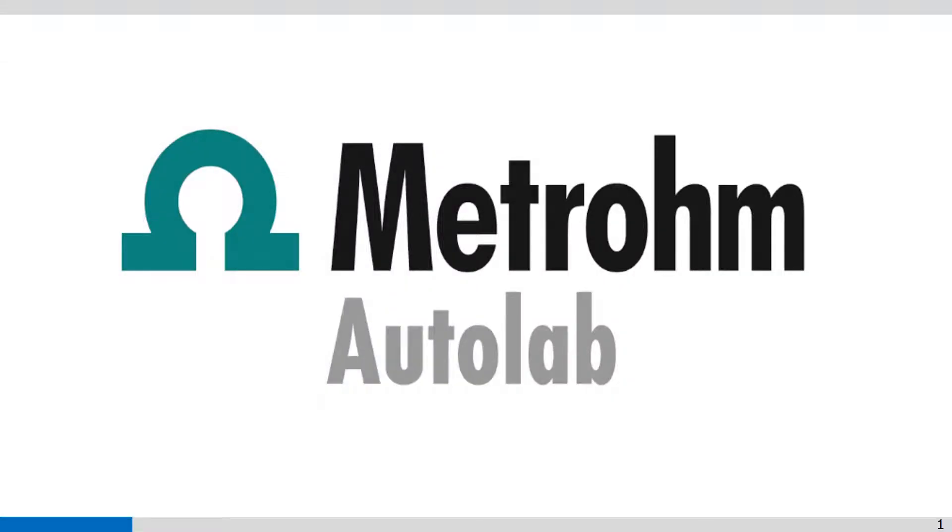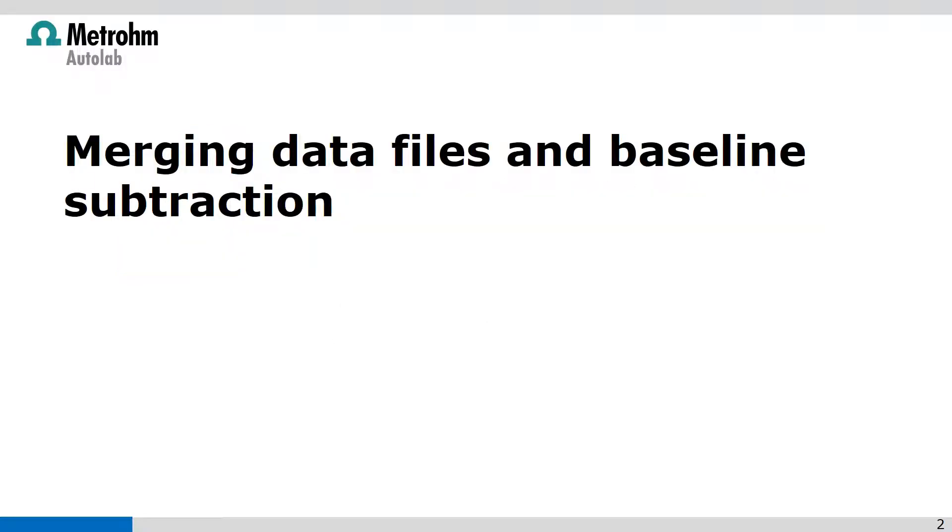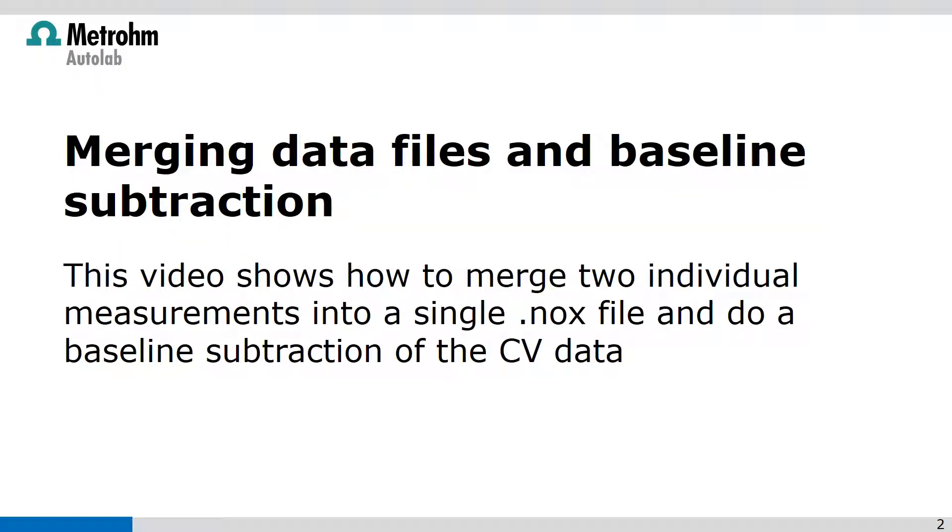Welcome to NOVA videos. In this video, I'm going to show you how to merge two individual measurements into a single .nox file and do a baseline subtraction of the CV data.